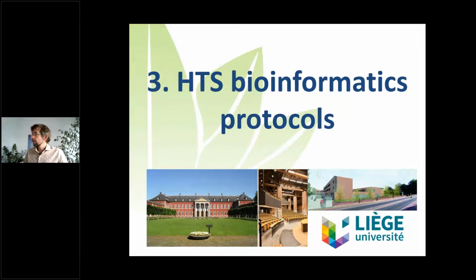What is the purpose of having long RNA fragments for RNA sequencing if then it is fragmented into short fragments? That's why, in fact, it's not so important to have a very good quality. But what you never know, and I have no proof of that, it's my educated guess, is that the speed of degradation is different between RNA sequences. And it goes back to another question that is here: will RNA from a capsidated virus be more resistant to degradation? Yes, clearly. That may also be an origin of the fact that even with very low RIN, we can reconstruct the whole genome of viruses.